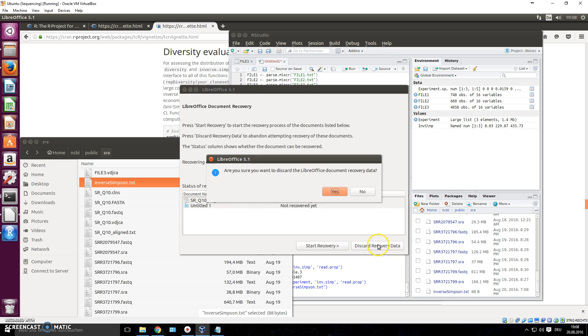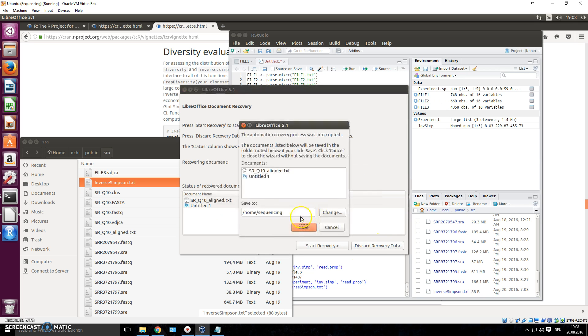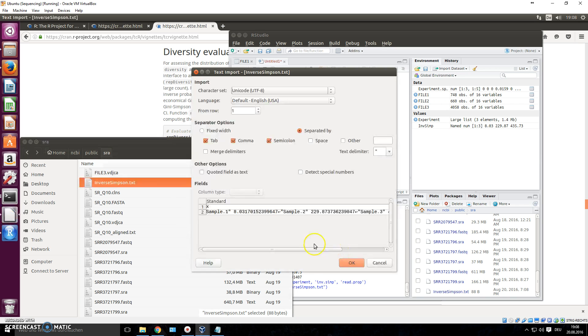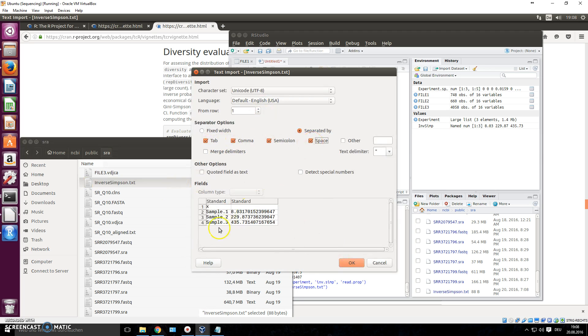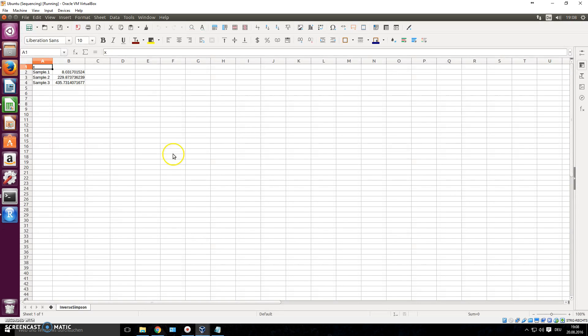So you can now open this, open with use calculator, it should be tab delimited. We don't need to recover anything. It should be, I think it's space. Use a space as a delimiter. So you just press space and okay. And there we go.